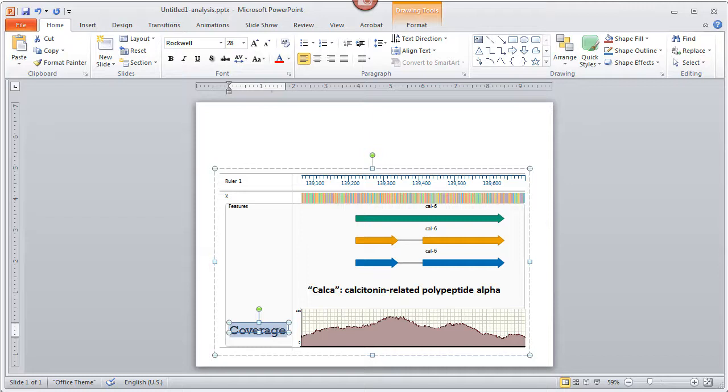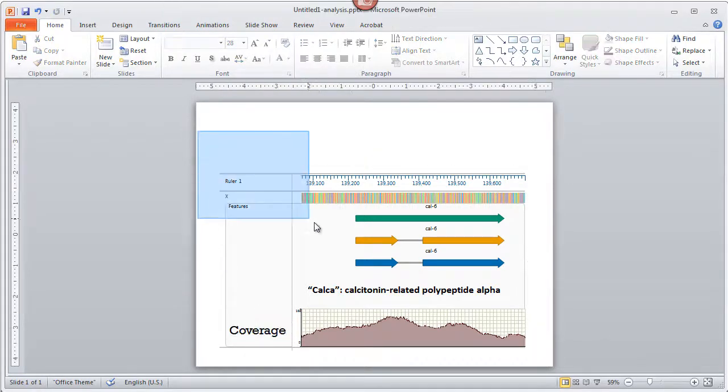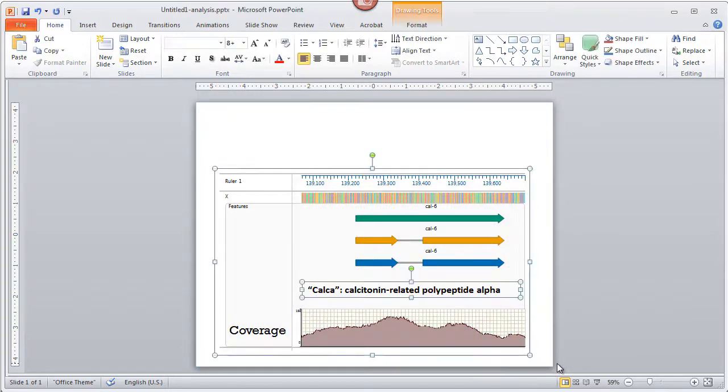When you make changes like this, note that the individual components of the image will become ungrouped. If you plan to move the image to a new location, we recommend regrouping the image components in order to keep the sequence, features, and graphs lined up correctly.